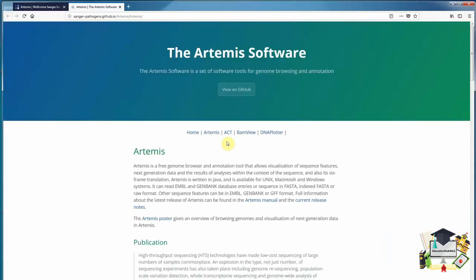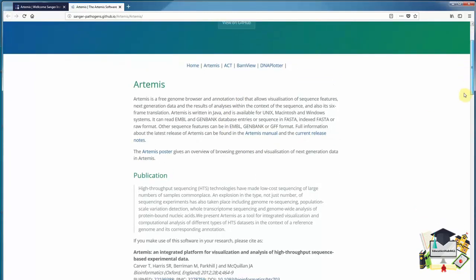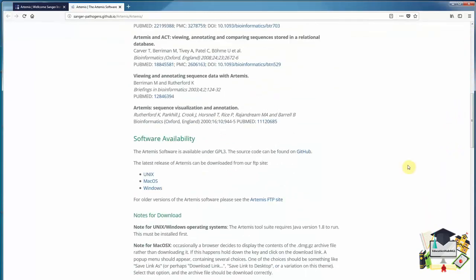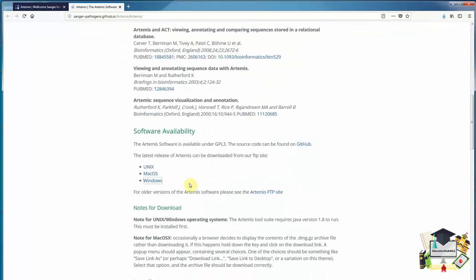GitHub is a repository for scientific software. This page contains more details of Artemis and other associated software. We need to scroll down to the Software Availability section of the page. Here we can download the software. As I'm on a Windows PC, I will click the Windows link and save the file.